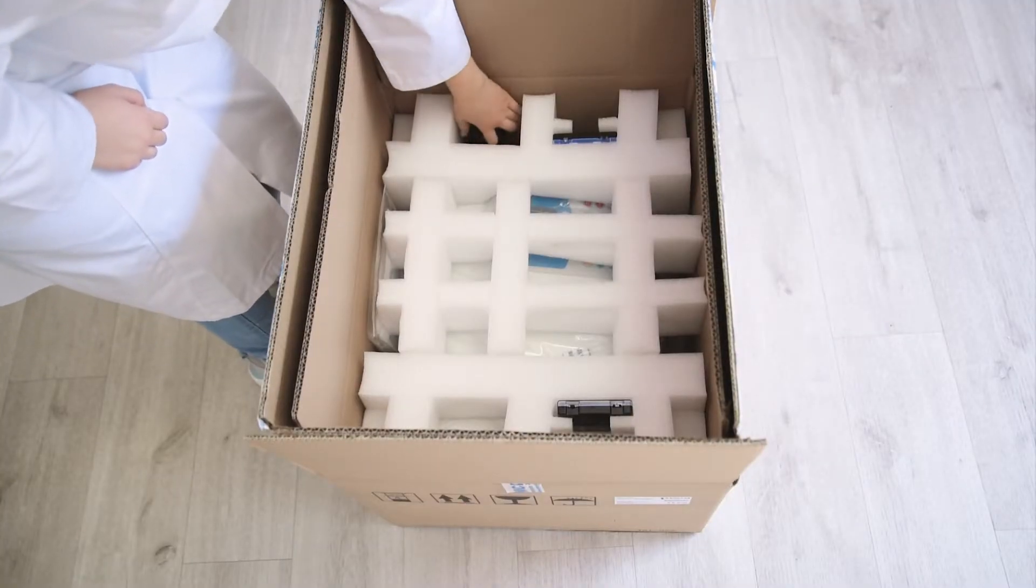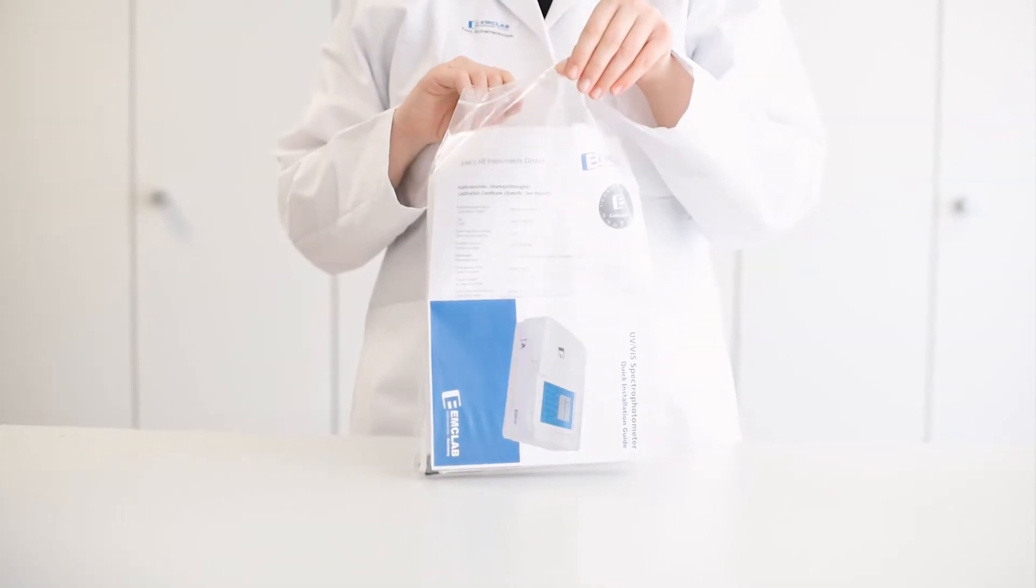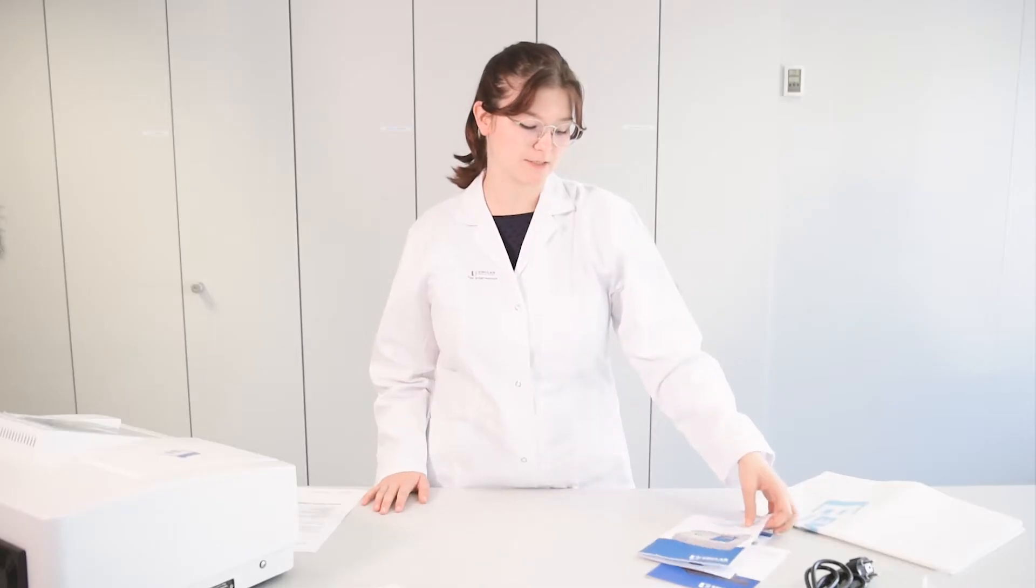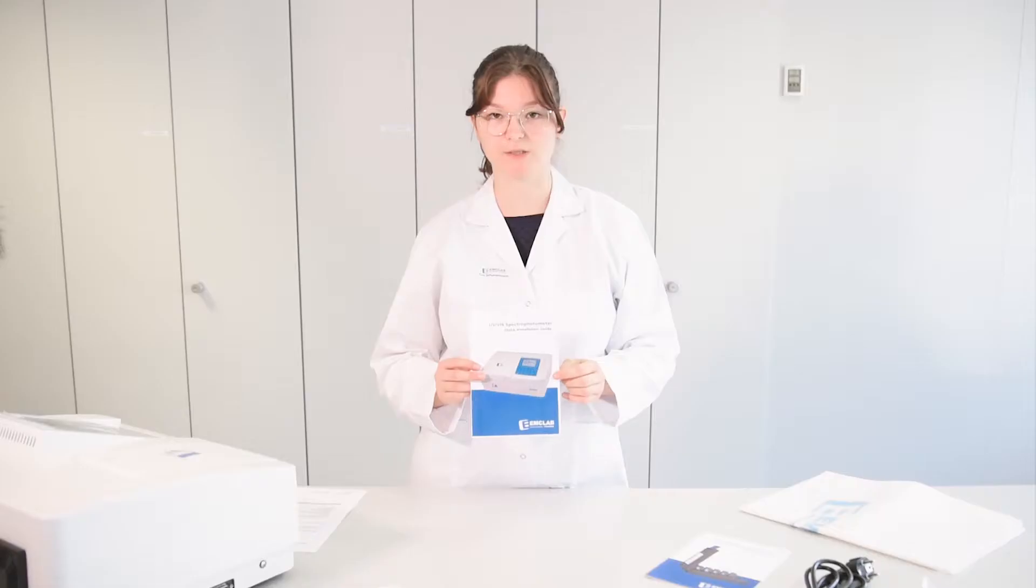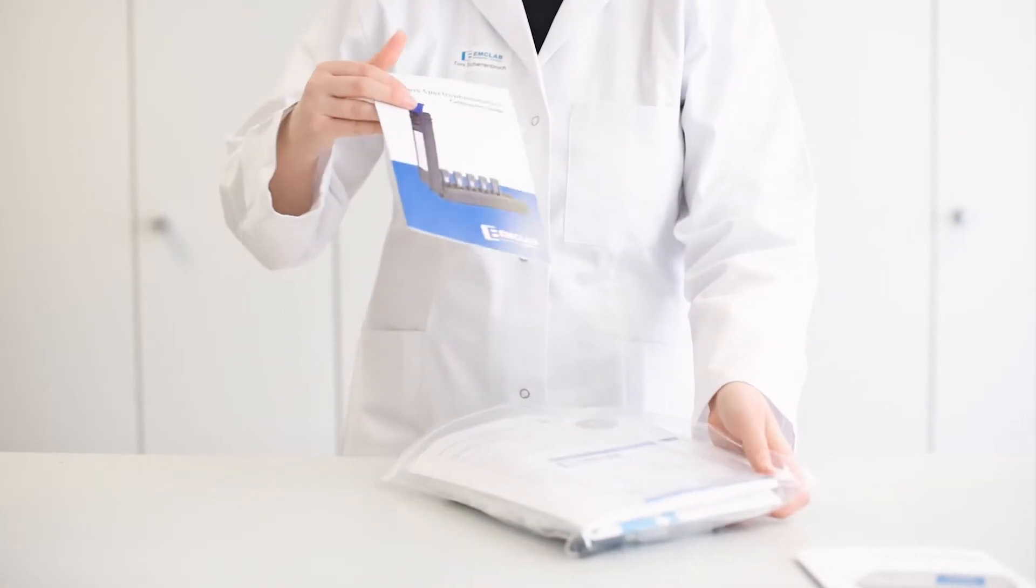Next there is the power cable included, and then we have an accessory bag with the following items. There is the quick installation guide to help you set up the instrument quickly so you can start right away. Then we have the calibration guide, and if you need any more support you can always go back and watch our first tutorial.